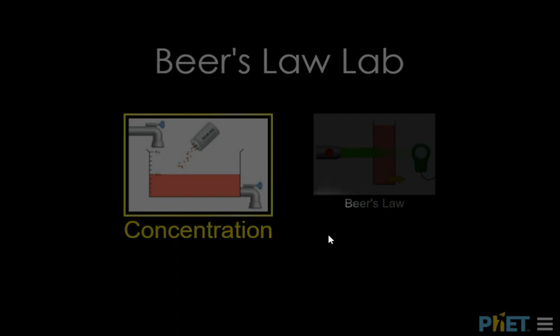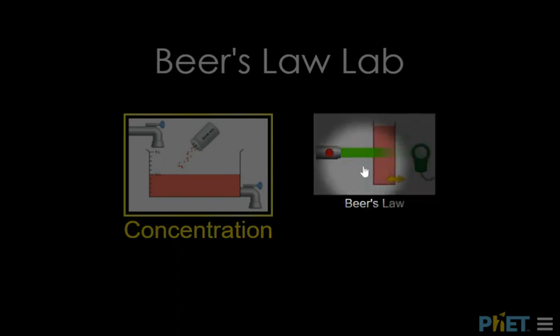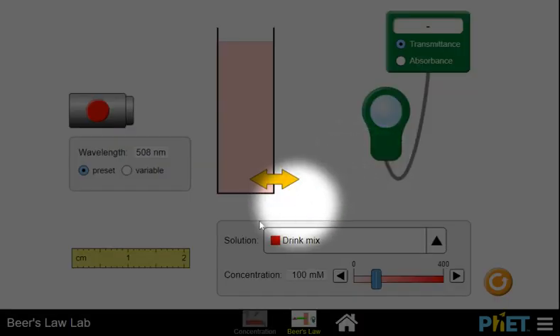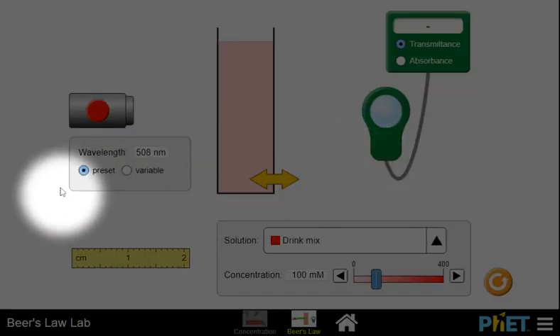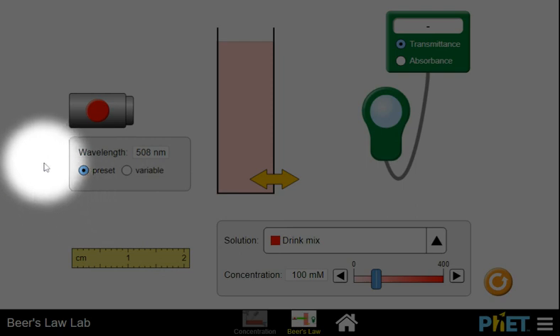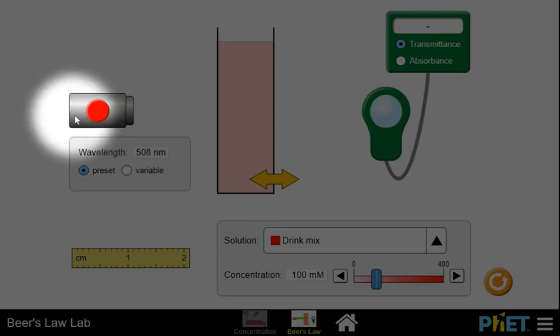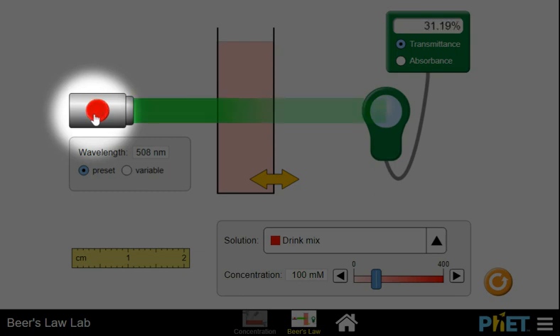First thing you need to do is click on the Beer's Law icon, and that will open a window where you have the basic components of a spectrophotometer. You have a light source, which you will need to click on.